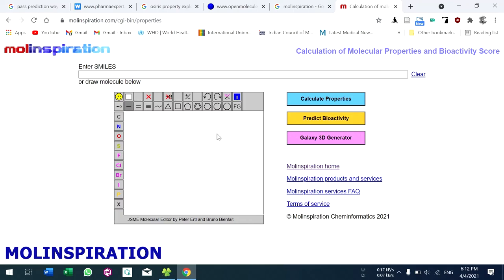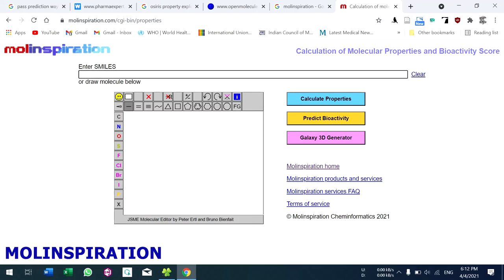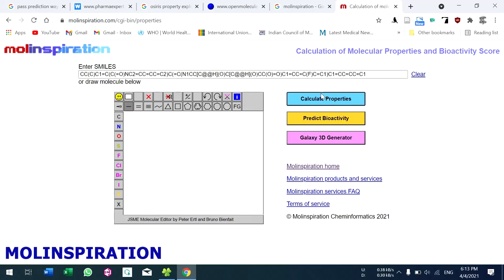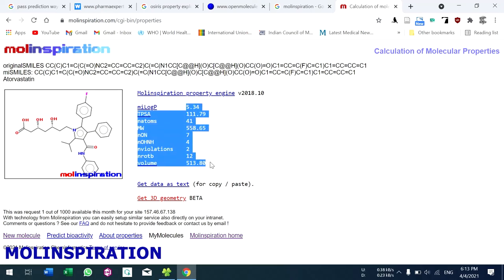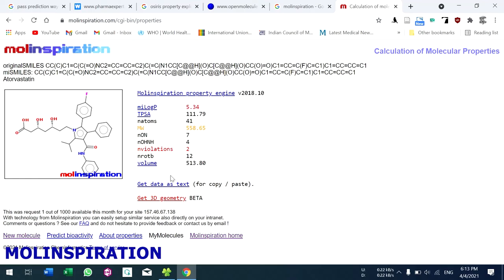Enter the SMILES format and click enter. To get properties, click 'Calculate Properties'. Here you can see the structure and get the calculated properties. If you want the results as text for copying or pasting, click here.